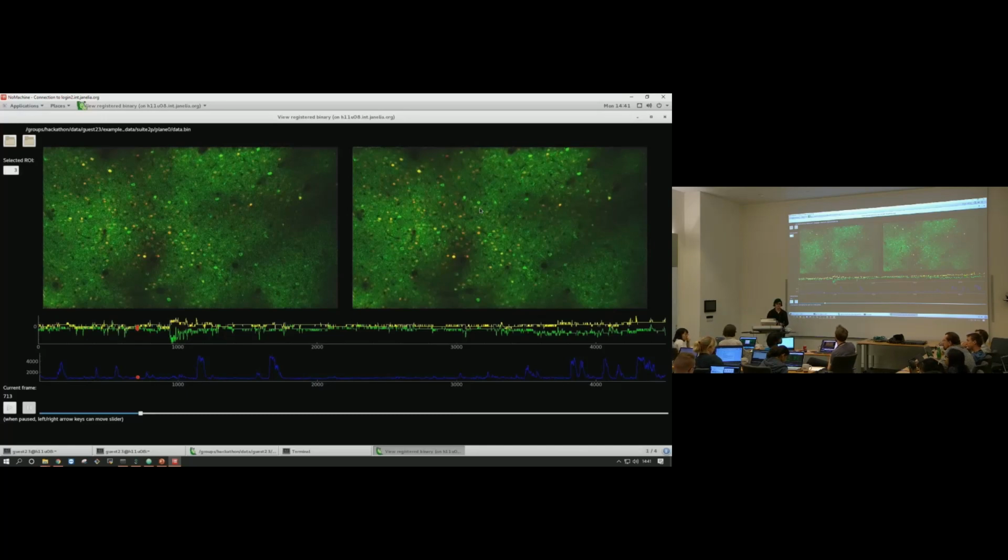Can I ask though, so we use different zoom factors, sometimes 3, sometimes 4, sometimes 5. But then it would actually make sense, right, depending on the zoom factor, to change the maximum shift, for example? You actually would want to express it in microns, I guess. Yeah, so you definitely could change it yourself. I wouldn't want to put it in microns, but it's an option. We could consider doing that, but then the user would always have to tell us what their pixels per micron are. I'm fine with computing backwards from microns. Right, but that is a good point.